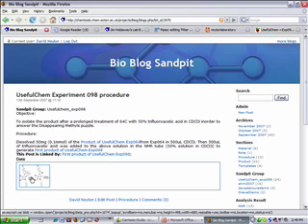I'm slightly uncomfortable with that, but that's just because I think of a lab book as a log of what's happened. And I think it's a question of what these things are being used for. So the object of Useful Chem Wiki is to provide information so someone can come to that and realise how they should do the experiment. That's less true of our system because they have to track back through a series of things to figure out how they ought to do it, but they can see the process that's happened.